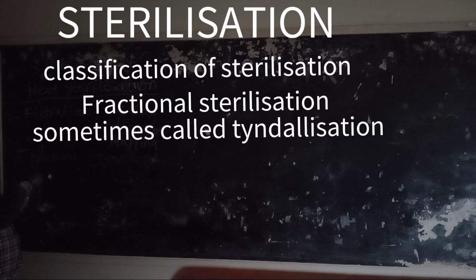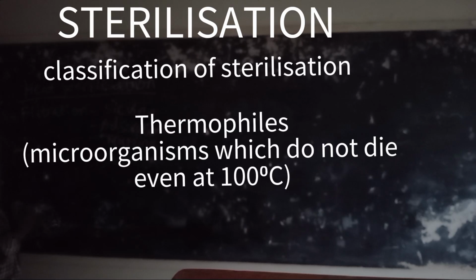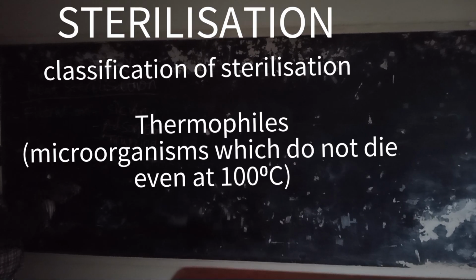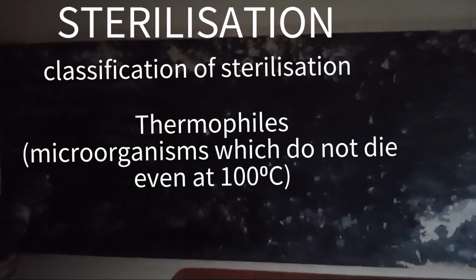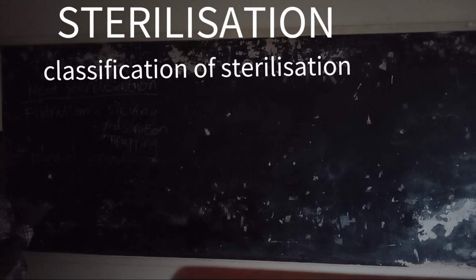It is good, but may not be effective for some thermophiles, which don't die at this temperature.